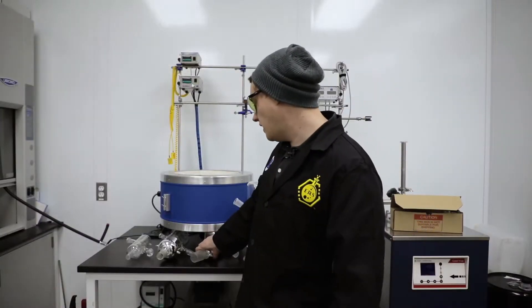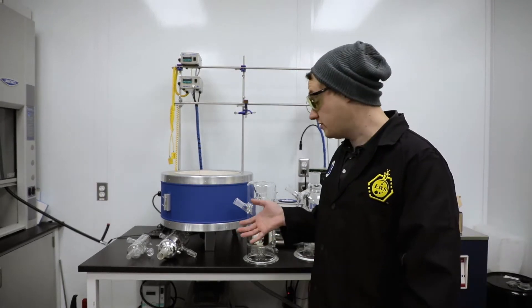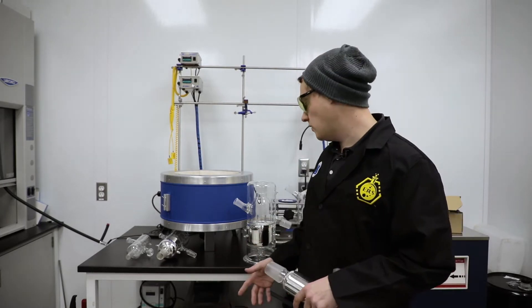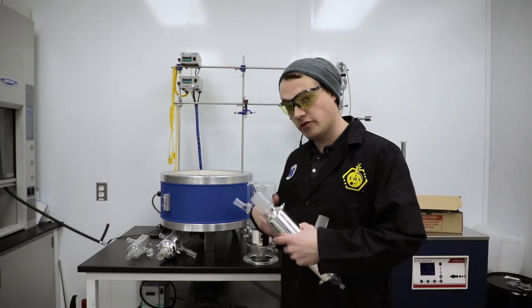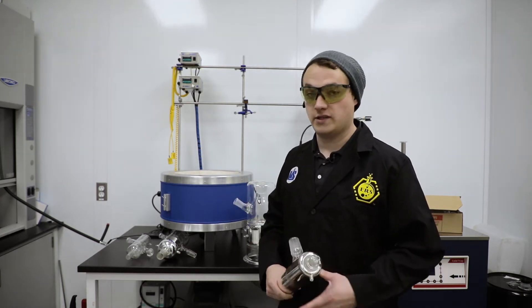Over here I've got an array of different distillation heads behind me. Some of these, most of you have probably never seen. We were kind of waiting for some patents to get issued, as well as just really trying to make sure that we've gone through every little bit of testing before releasing the product line.